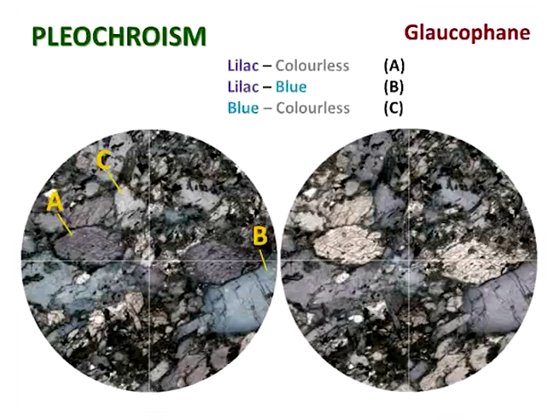So let's look at another pleochroic mineral, glaucophane, and this is a lot easier. To my eyes anyway, these colours are a lot clearer. So you've got some very definite differences in the colours here. You have an A section here, which is a basal section. You can see the cleavages. And that looks to me a kind of purplish colour, lilac I've called it. But you also have longer prism sections, which are a kind of paler blue, more sky blue colour.